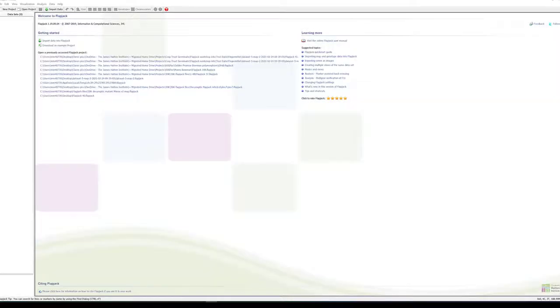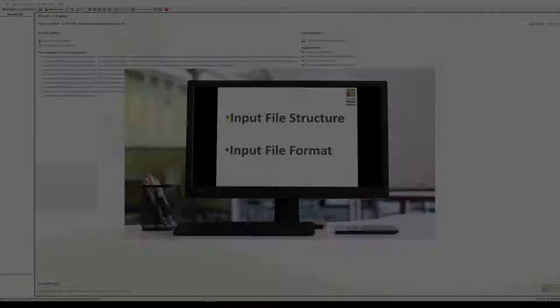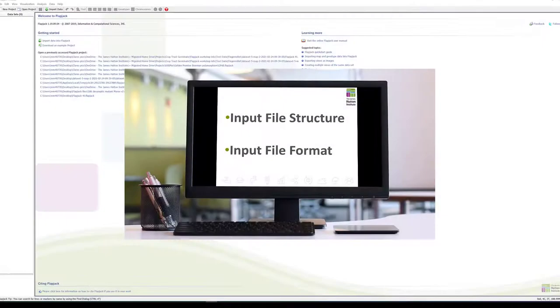Hello and welcome to this Flapjack tutorial where we will cover the following topics: input file structure and input file format.